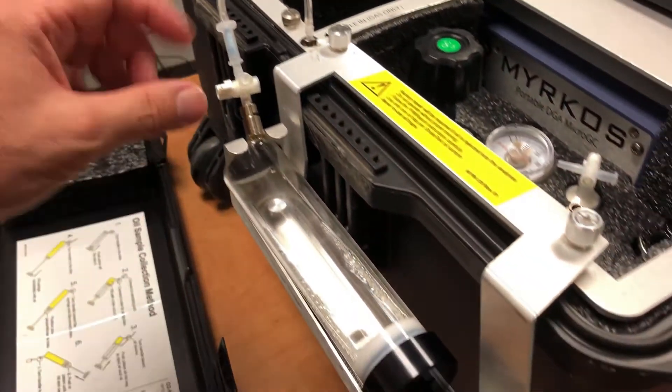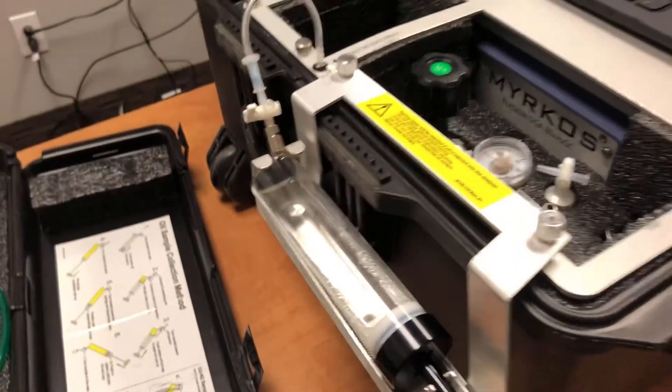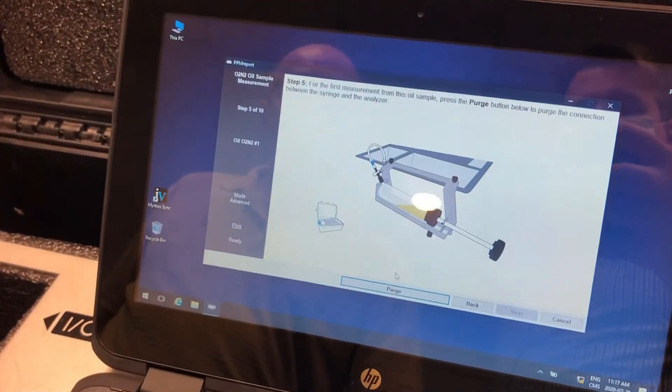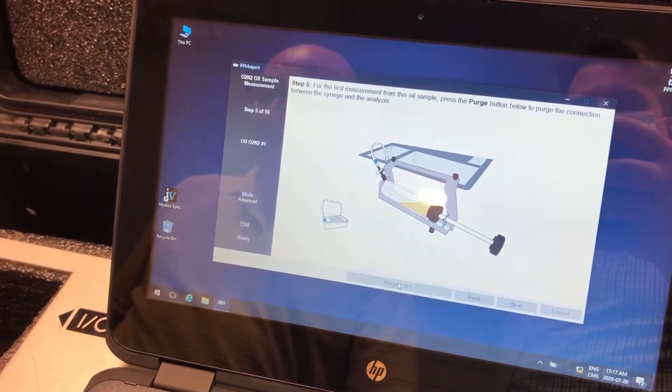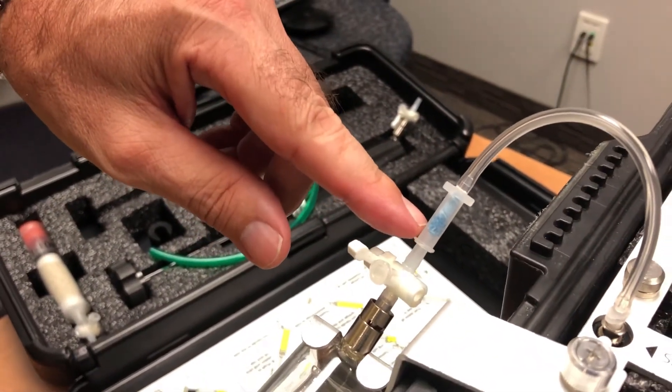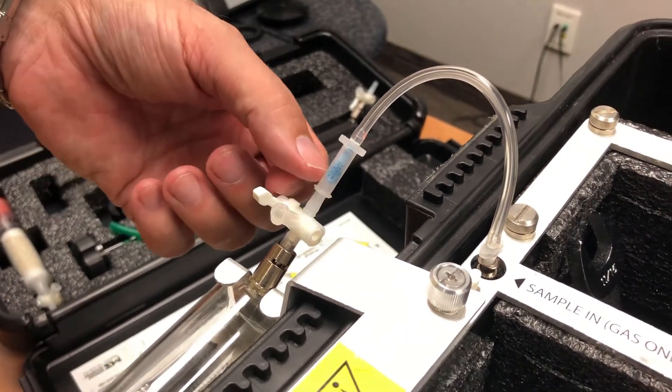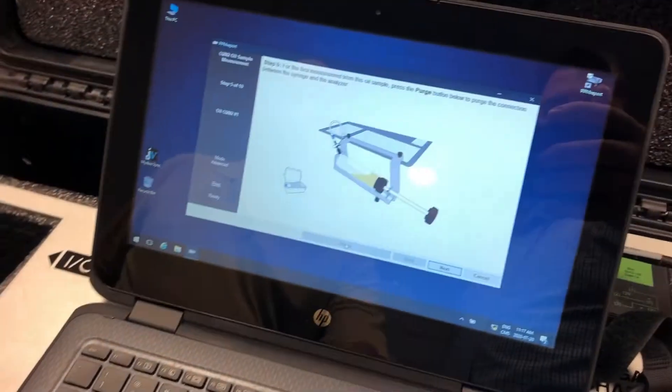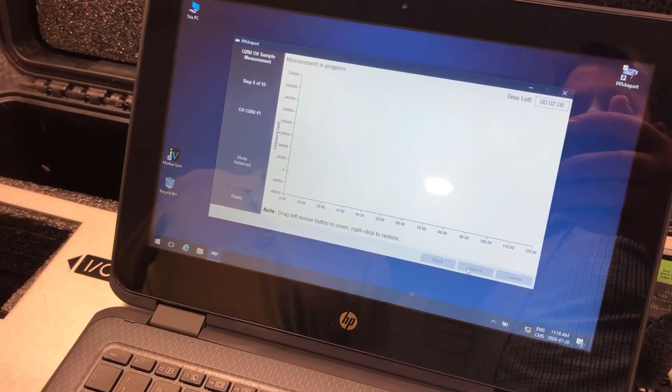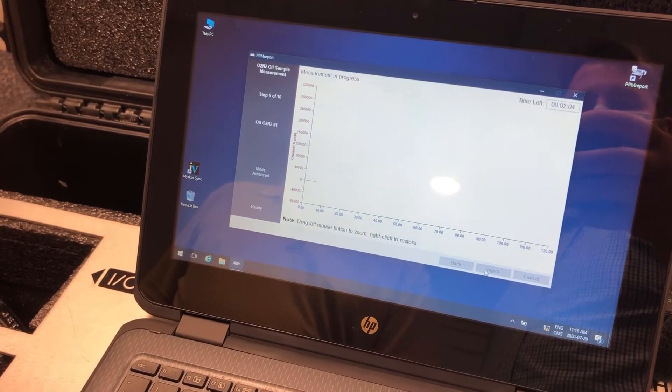And we don't see any changes in the volume of gas, meaning that there's no leak in the system. And the next thing is we will purge for 10 seconds. Again, you can see more oil that was on the surface here being picked up by the oil trap filter that's becoming dark blue. And then next, we inject. So now, in two minutes, we're going to have our full oxygen-nitrogen measurement.